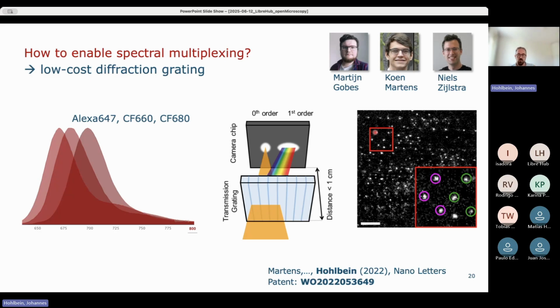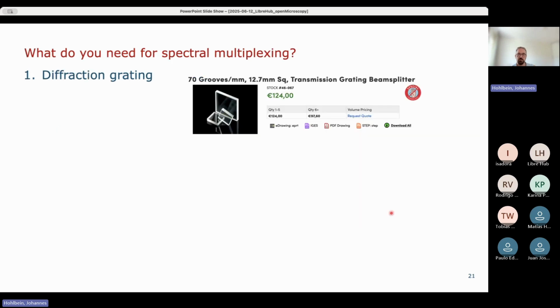Every single molecule is now showing up in a pair, and we simply detect the pairs, measure the distances, and then we know which of the colors we have, whether it's a short distance or a larger distance, and we can map that back onto the image, including the super-resolved position.